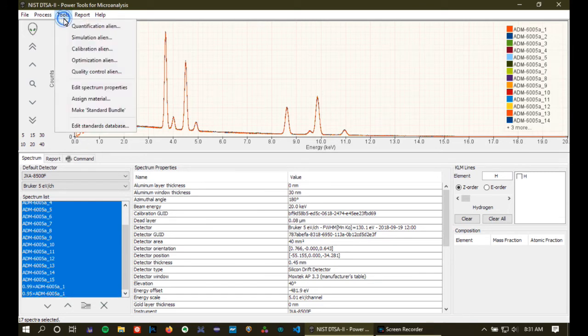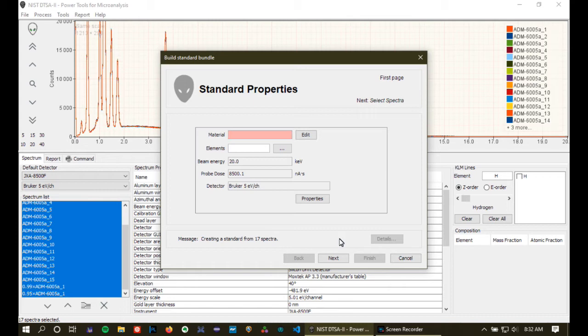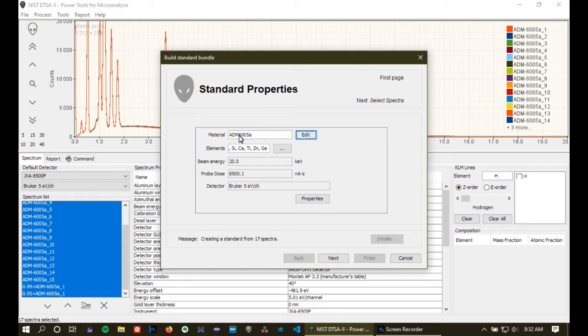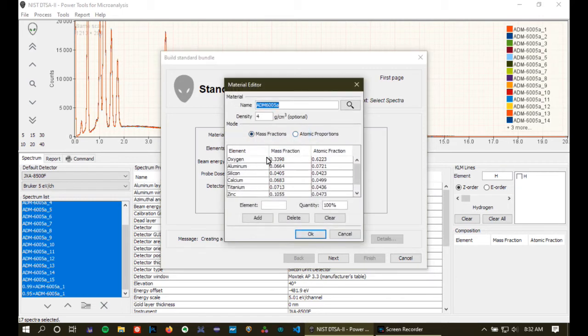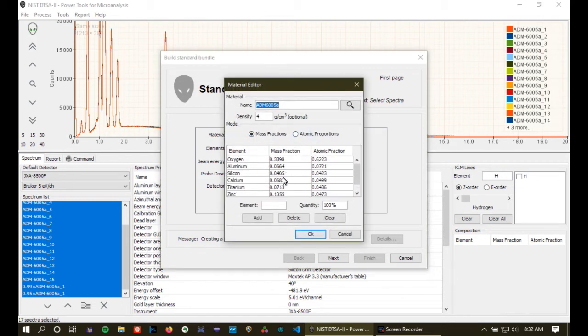All right, so let's go up to tools here and select make standard bundle. So the first thing we're going to get is one of these wizard type interfaces which steps you through the process of creating a standard bundle. First thing it's going to ask us for is what is the material?